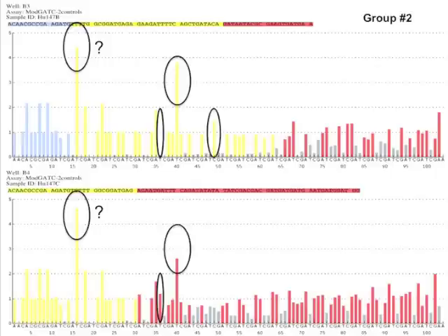Dispensation 49 here, there's a C that has been dispensed at this location, and the machine is calling that about 1.5 Cs were added to that extending strand. But if we look at that same position in the next pyroprint, you'll notice that there is a gray bar there. We consider gray bars to be 0. The machine basically doesn't recognize them, and so it called out 0 Cs being added. So again, this is something we would call a major difference, the presence or absence of bars.